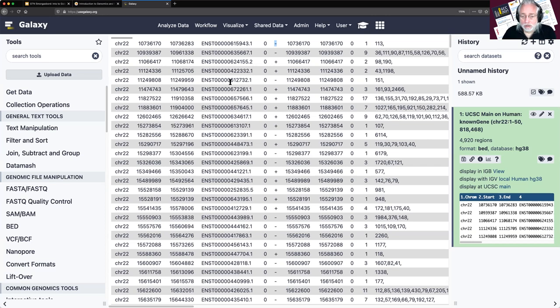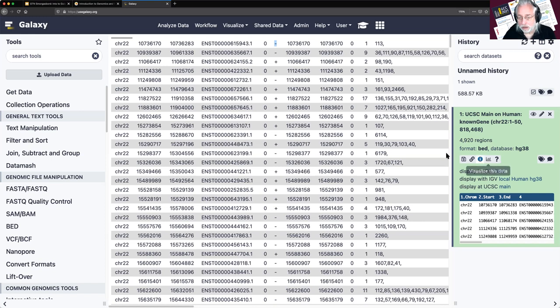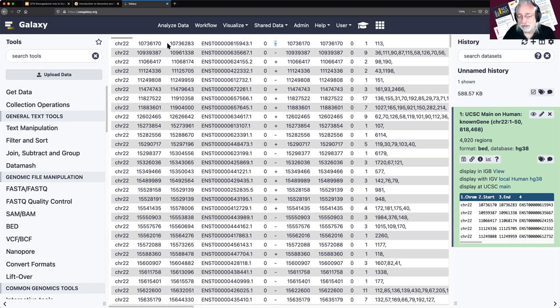So that's our data. We got about 5,000 transcripts, and we know where the pluses and minuses are, the chromosomes, and the start and stop positions. That's going to be useful because we want to check to see what overlaps — does this gene overlap with that gene?